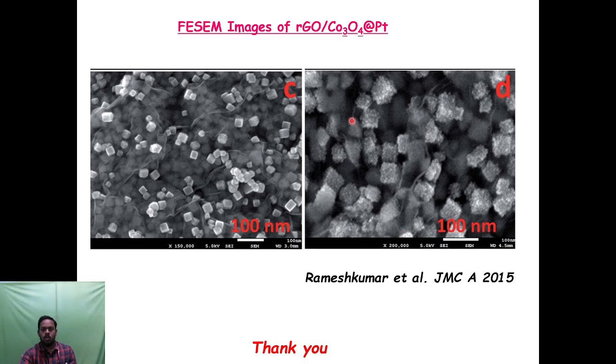So this is all about scanning electron microscopy, the electron probe method, what the secondary effects involved in SEM analysis are, what the components of the scanning electron microscope are, how to perform SEM analysis, and some examples of scanning electron microscopic images.